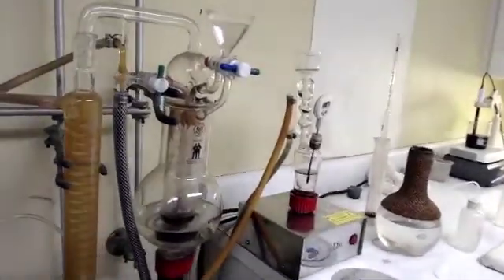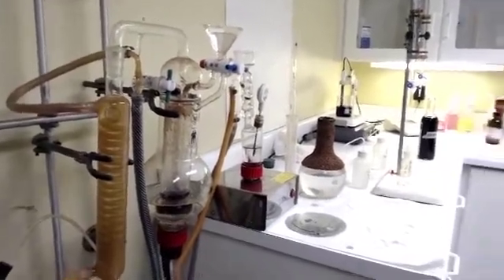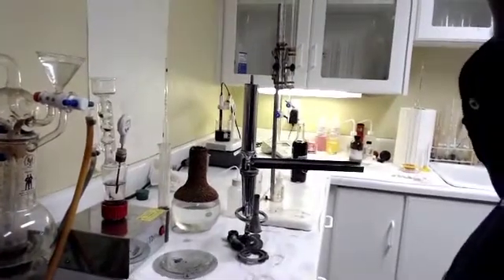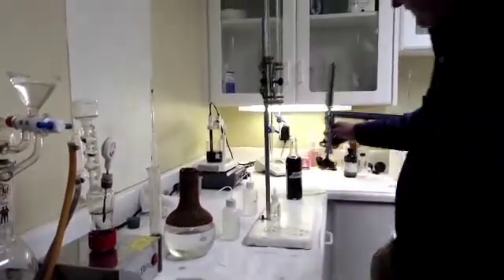I'm going to pull up the old type here. This is the old type of ebulliometer that we used to use — this is well used. You can tell I put stuff on it to keep it from tipping over. But anyway, we'll set it aside.